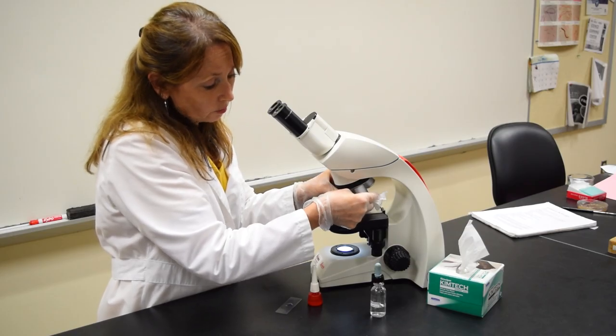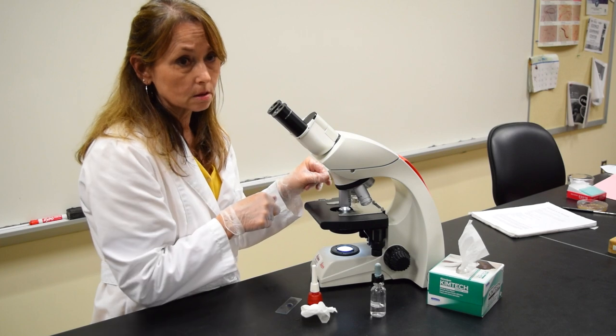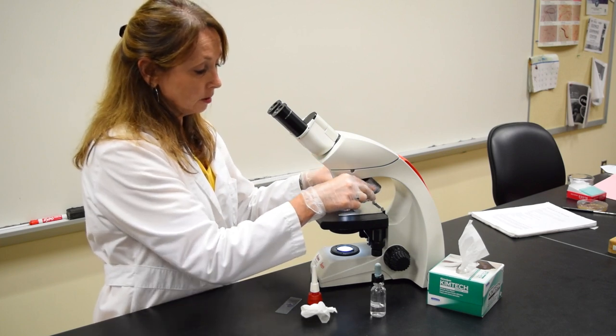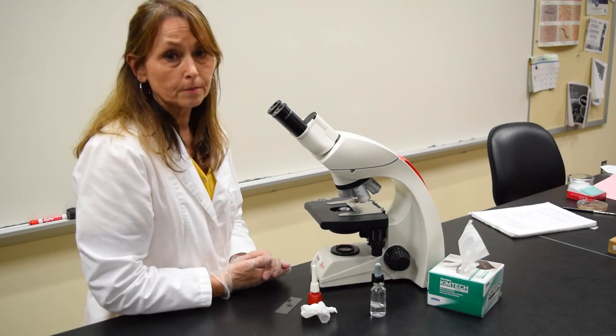Then clean the oil immersion lens. The oil immersion lens is the only lens that should go into the microscope oil. Make sure you clean the lens before you put your scope away. Move the coarse adjustment with the scanning power objective in place and you can turn off the microscope.